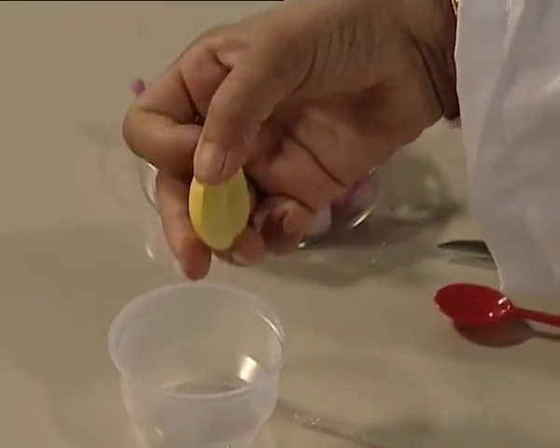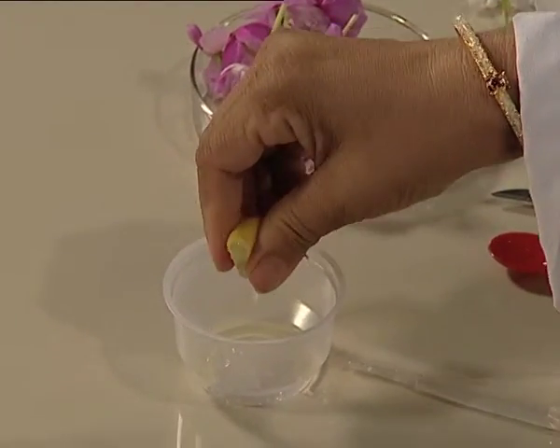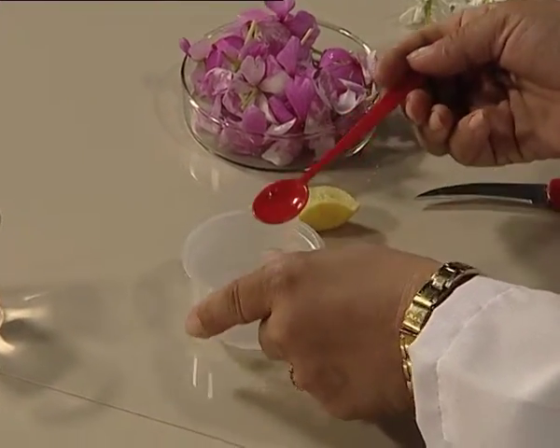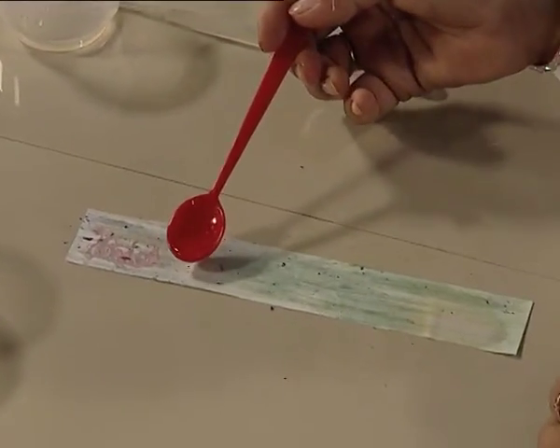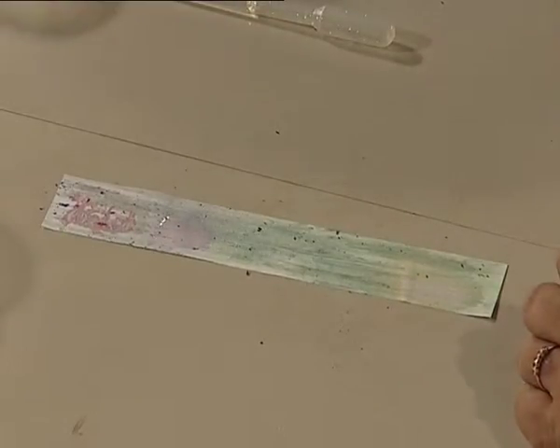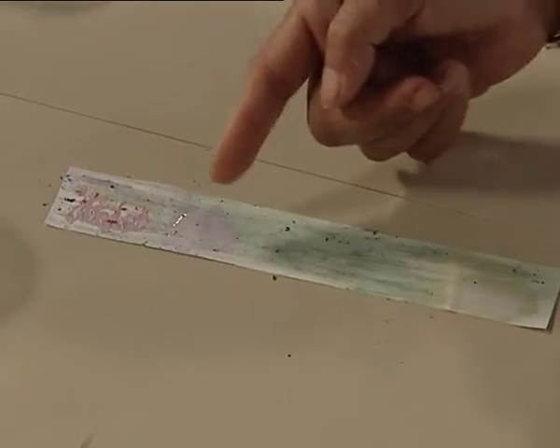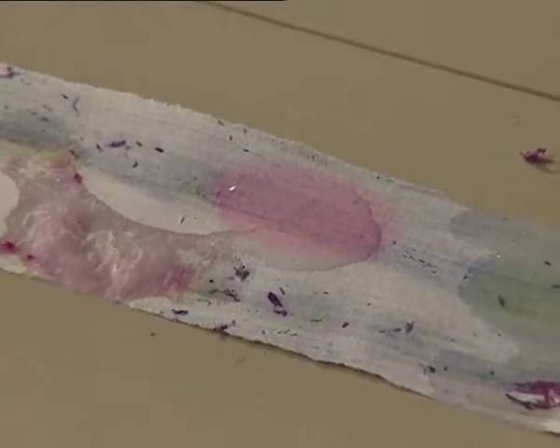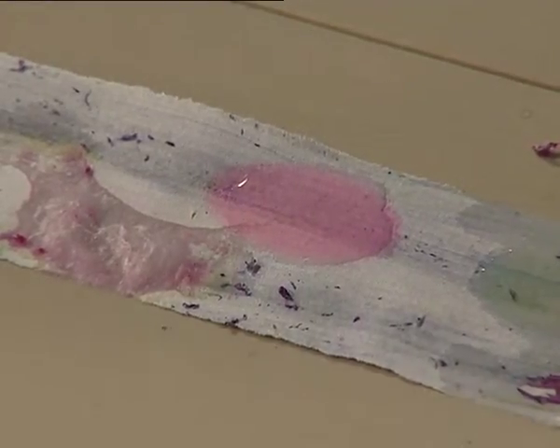Now, same way, we can always find substances which are basic or acidic in nature in our house or around us. Similarly, I have here a lemon. I am squeezing the lemon and adding some water to it. Now I am taking some of this lemon juice and adding it here on our paper. What kind of colour change do you observe? Something similar to hydrochloric acid — it is turning our flower paper to red. So think, what properties must lemon juice be having?